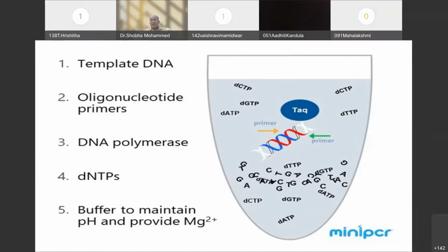Now, this is what I call an aliquot. You can see the aliquot here. This compartment I call an aliquot. In the aliquot compartment, I have the DNA. This is isolated DNA. And these are primer 1 and primer 2.